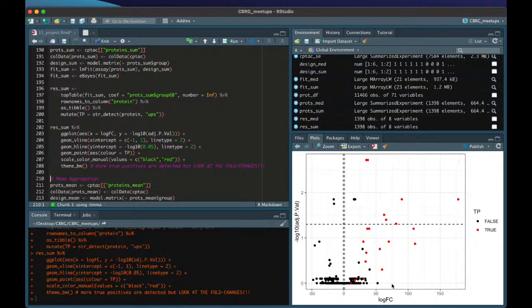one thing I do have to confess is I only realized somewhat belatedly, look at the log fold changes, they're incredibly high. So when it comes to sum aggregation, I'll talk to Paul about this. The order in which you do the pre-processing of the data clearly matters here. So something went wrong with the sum aggregation.